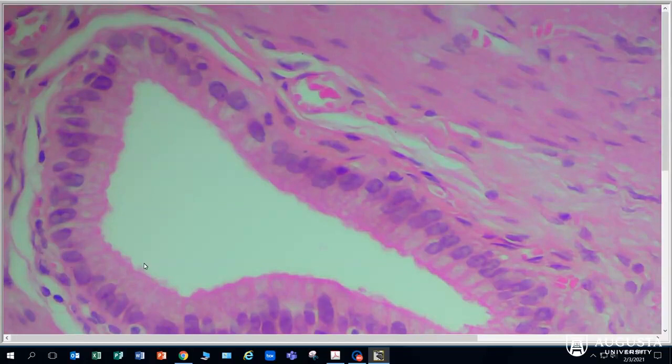In columnar epithelial tissue, the nucleus is always located towards the basal side of the cell. So these cells are big, tall, column-shaped cells. And the nucleus is a little more egg-shaped, and it's located closer to the basal side of this tissue. Again, here we have big, tall, column-shaped cells where the nucleus is closer to the basal side.